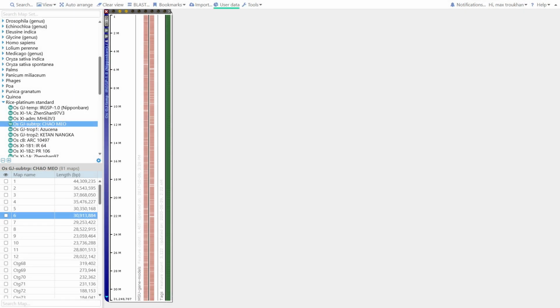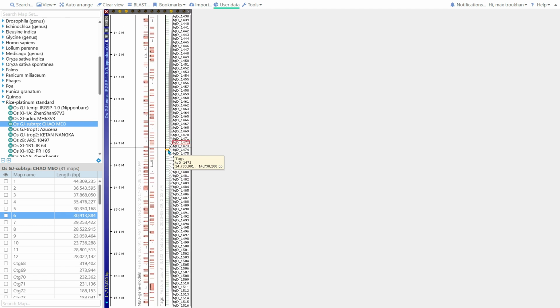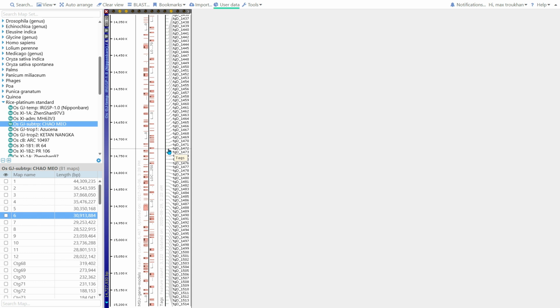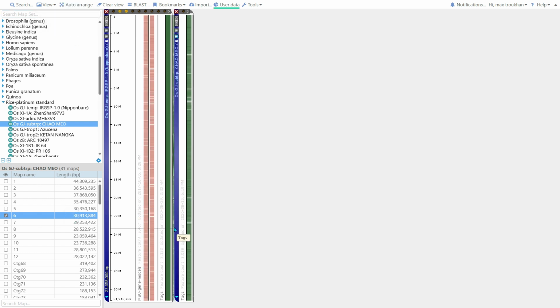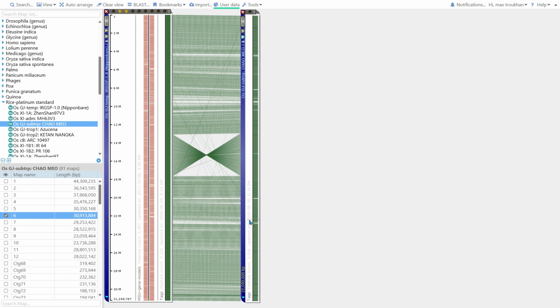The Persephone platform offers tools for data loading and processing on the back end. For instance, it allows the creation of artificial markers by extracting small sequences at regular intervals from a reference genome. These sequence tags can then be mapped onto other genomes, providing a fast and efficient method for linking and aligning maps of organisms with high sequence similarity. When identical markers are linked, the connecting lines indicate regions of synteny and structural variations.